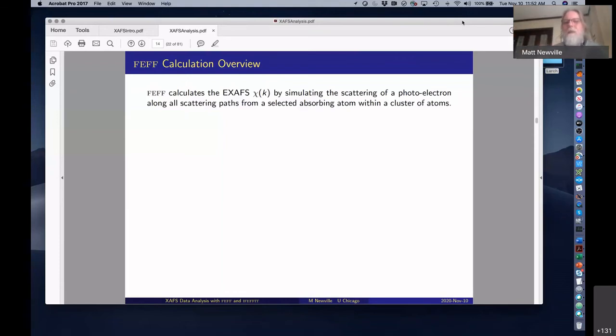And I think what people find when they do that is it doesn't vary that much. It's typically between 0.8 and 1. When you get to the point where you need the coordination number to better than 10% to answer your scientific question, then you know how to do that well. Mm-hmm.